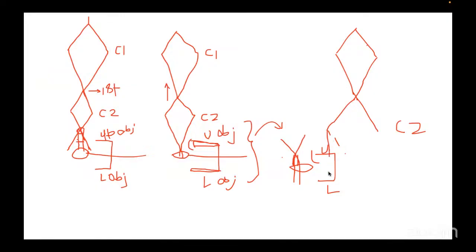We make a very under-focused lens current. So if your sample is there, the electron beam is almost parallel, but it will expose your entire sample. That is the main reason we prefer to converge the electron beam just above the sample, do the imaging, and use the objective lens current to make the electron beam parallel. Is it clear?